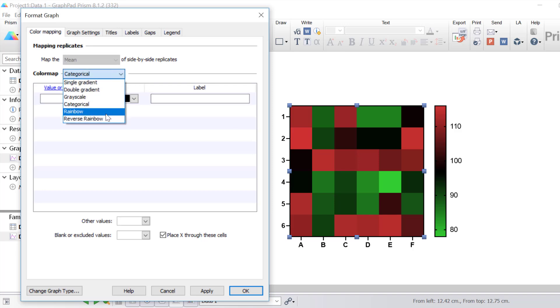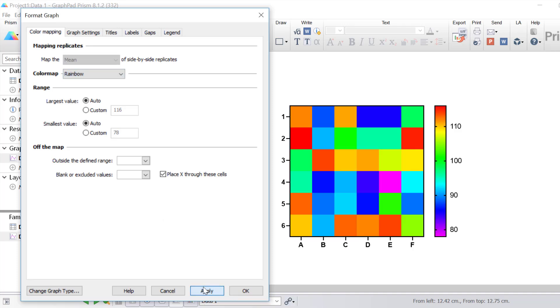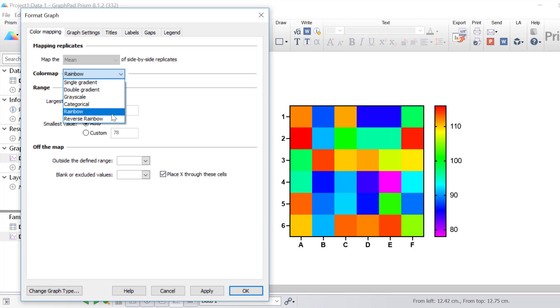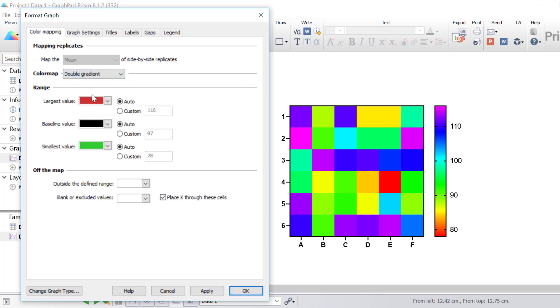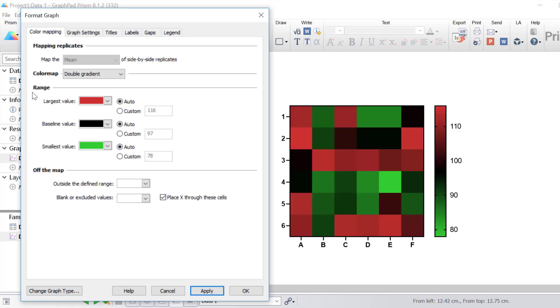Another option is rainbow, where you can choose the range of data values. Prism fixes the saturation and brightness to 100% and varies the hue from 0 to 300 degrees, with the largest values shown in red. If I click apply to preview this, notice how the colours are now in a rainbow style. You can also select reverse rainbow, where the smallest values are encoded as red. In this example, I'm going to select the double gradient colour map. You can change the colour of the largest value, currently set to red, the baseline value set to black, and the smallest value set to green — all set to auto, but you can select custom if you wish. I recommend leaving everything as auto.